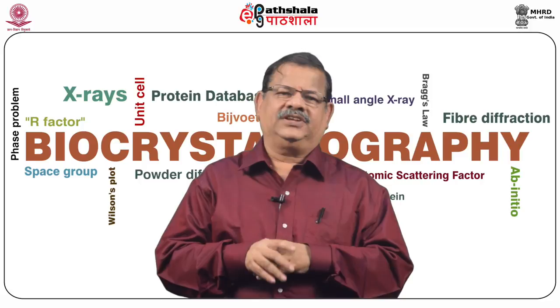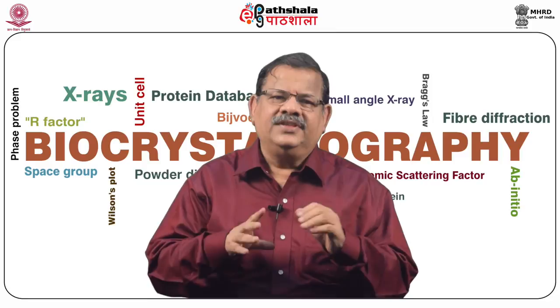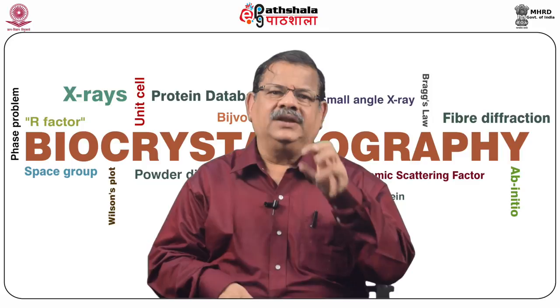But of course the best solution can be picked up by the term known as combined figure of merit, and only for this solution the E map is printed. So this is the reason why direct methods are called multi-solution in nature. That MUL stands for multi-solution.